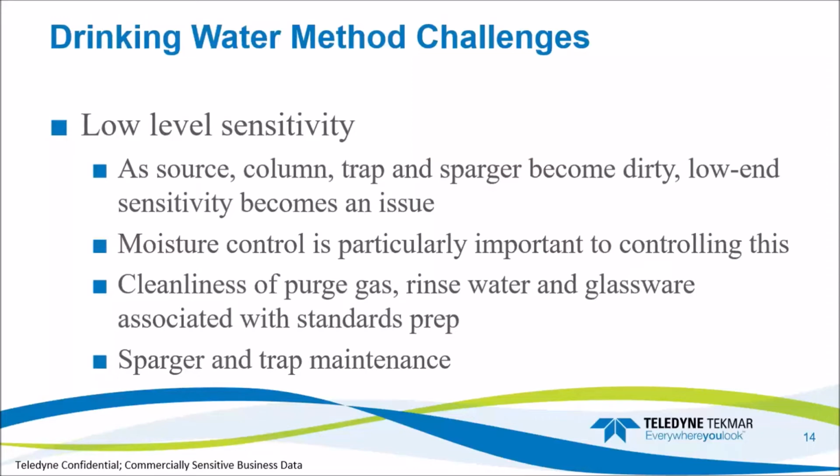Tekmar's improved moisture control fitting on the Atomx XYZ and the Lumen, and possibly adding some more dry purge time into your purge and trap method, can be particularly important for drinking water analysis. For all those front-end compounds that co-elute with the water peak, the less water there is, the sharper those peaks will be, and the more consistent their retention times will be. Keeping desorb times short and the split ratios high can also help manage the water and keep the front end looking good.